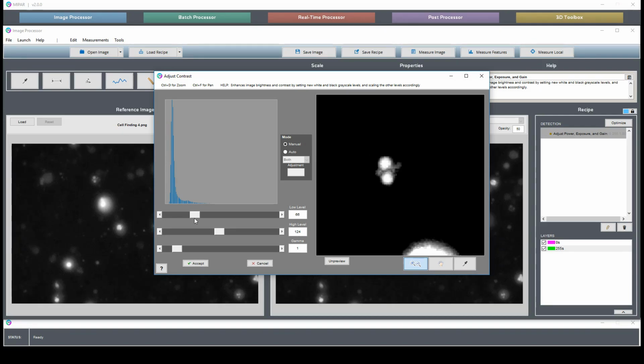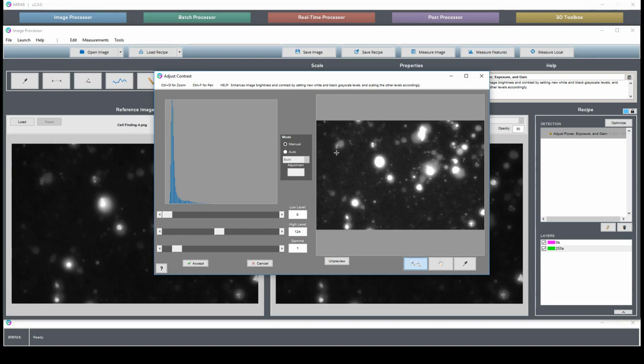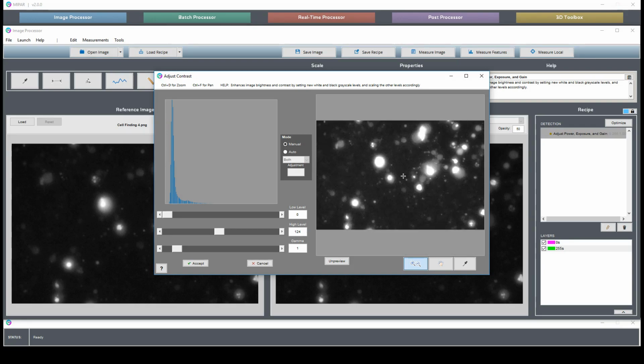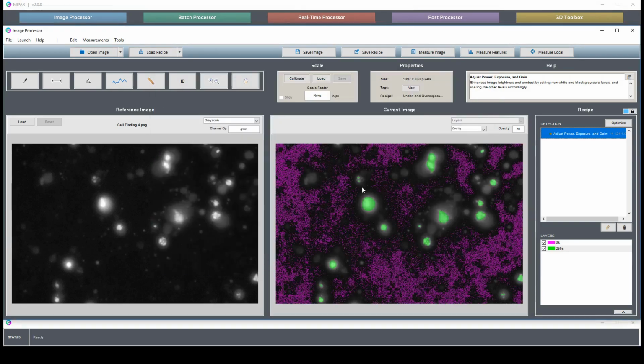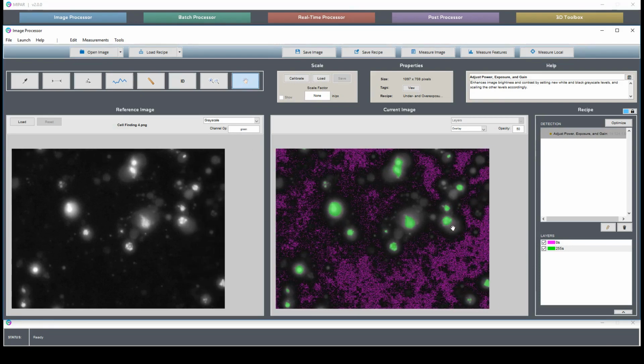Maybe you can artificially make them look smaller than they are. Or you could lose dim features. And all this adjustment is especially dangerous if your image itself isn't illuminated evenly, if you would need different values of exposure in different parts of the image. So it's important to have your levels set so that you capture the background and you don't blow out any of your detail.